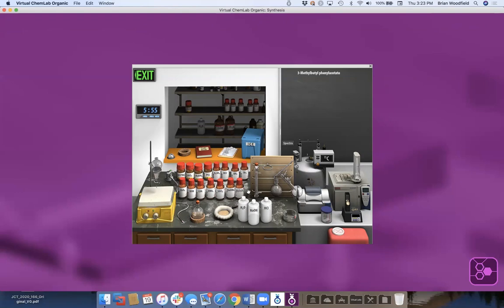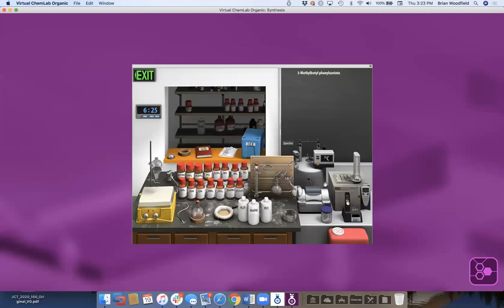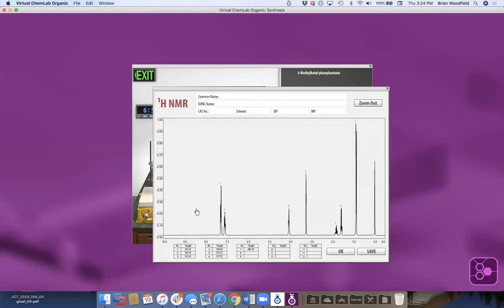So Brian, that was, I guess, going to be my question. So those numbers are area under the peak? Yeah, so what we did was we labeled these peaks, and then we knew the areas, because all of these NMRs come from Sigma, so they're actual real ones.